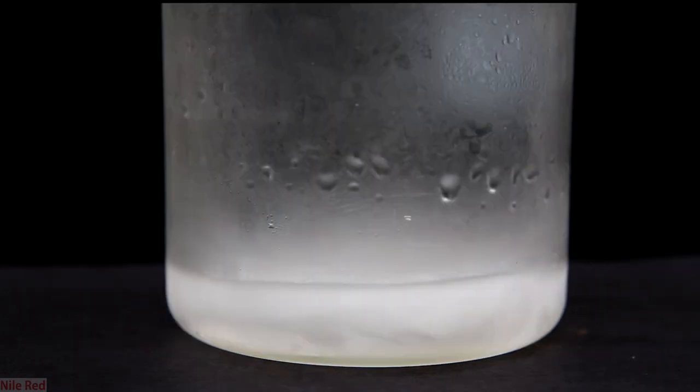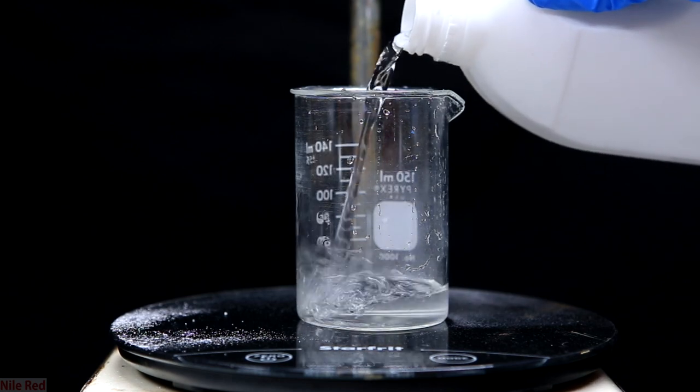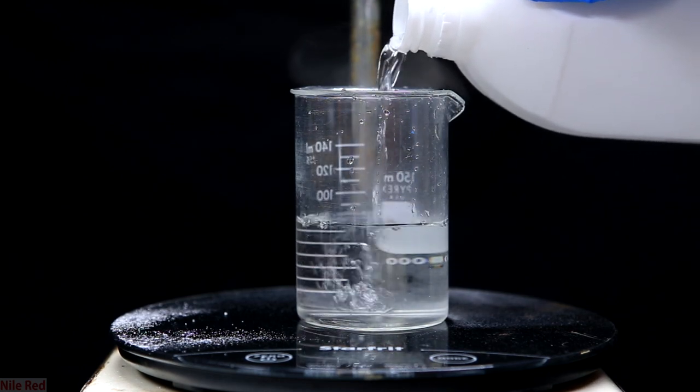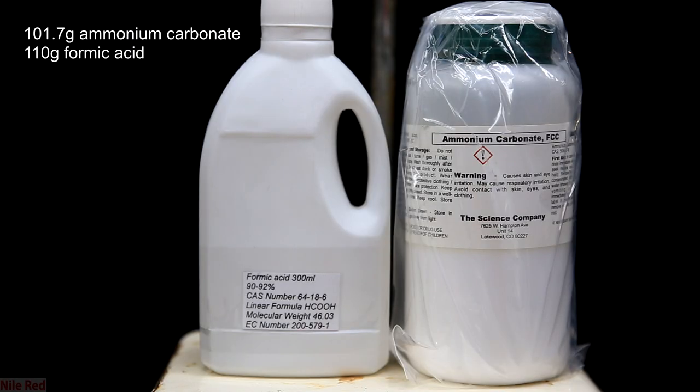I'm sure I'll find a use for it in the future though, because the Leucart reaction is pretty useful and I'm sure I'll find something that I can use it on. So for this experiment, we'll only need two ingredients: formic acid and ammonium carbonate.